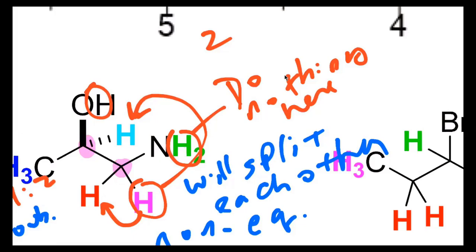So technically, they wouldn't have neighbors either, though, right? What do you mean, the NH2? Yeah, like the hydrogen on the nitrogen. Yeah. They wouldn't. Well, they do, on this carbon that's adjacent, but you don't count them because they don't see each other. Splitting and multiplicity happens when neighboring protons experience the magnetic field of the protons adjacent to them. But for some reason the nitrogen and oxygen protons, those protons on those atoms, don't get to experience that magnetic field, and so they don't split. Okay. Yeah.